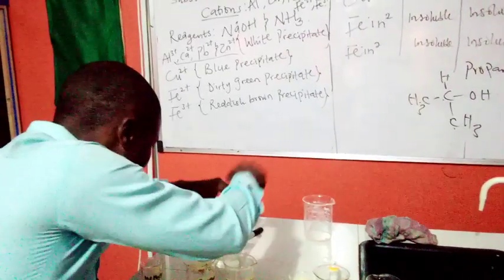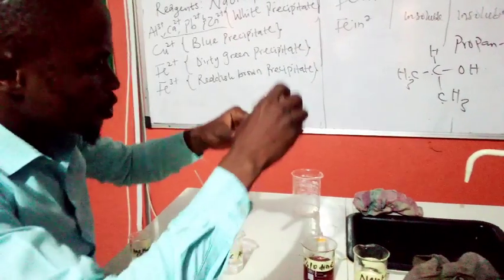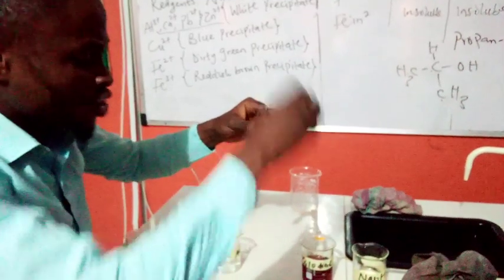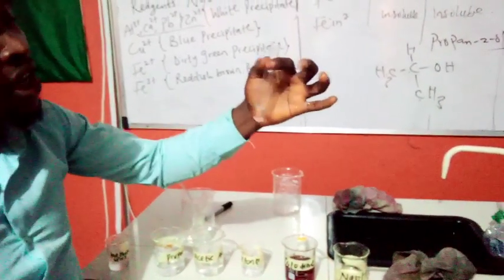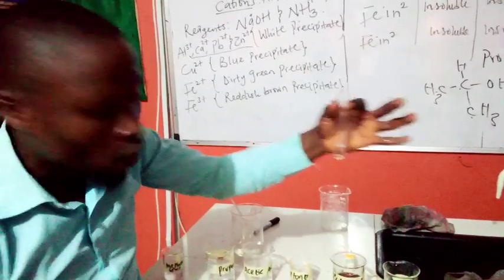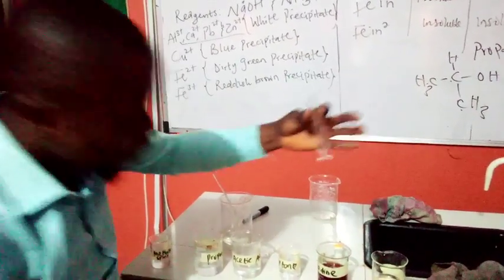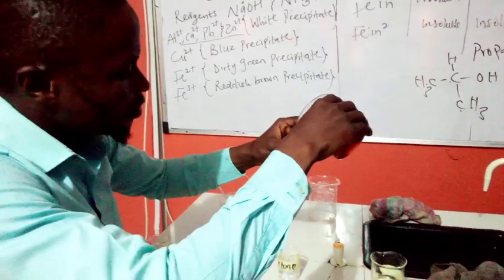Of course, this is not colorless, other than the lighting coming in. So then, of course, we can also use acetone. This acetone is actually a ketone member. In fact, it is the first member of what? Of the ketone family.